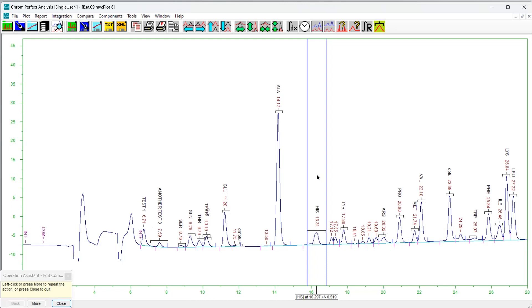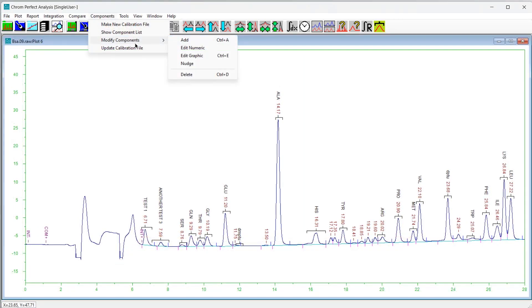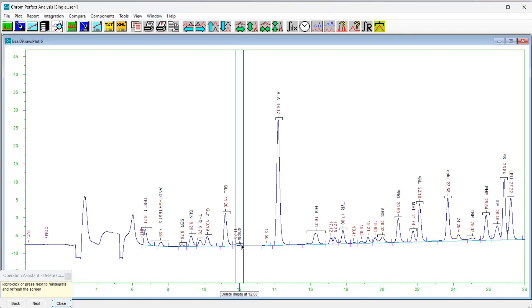To confirm the new component, either press the Next button on the operation assistant or right-click on the chromatogram plot. The chromatogram will be reintegrated and the new component will appear with its search window. To delete a component, choose Components, then Modify Components, then Delete. The operation assistant form will appear. Click on the chromatogram plot and the nearest component will be selected. To confirm the deletion, either press the Next button on the operation assistant or right-click on the chromatogram plot. The chromatogram will be reintegrated and the deleted component will vanish.